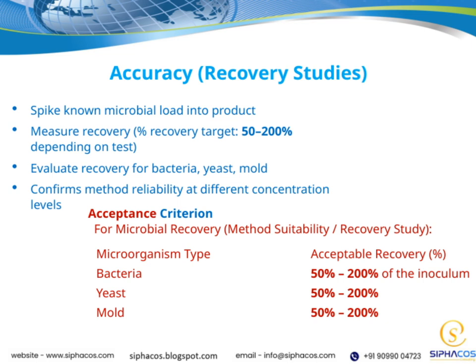specific test. By evaluating recovery across bacteria, yeast, and mold, we confirm that our method is reliable at different concentration levels. This ensures our testing is accurate and consistent, giving us confidence that we're truly capturing the microbial presence in our samples. Overall, these recovery studies are a critical part of validating our methods and ensuring that our microbial testing is both accurate and reliable.